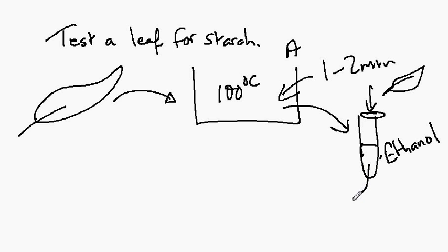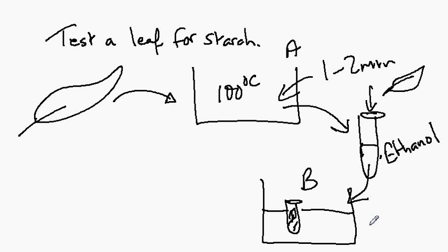Transfer the ethanol leaf test tube to water bath B. Now this is going to be a slightly lower temperature, but it's going to make the ethanol boil. So our test tube is going to be in the water bath and the ethanol is going to be in here with the leaf, and that should stay in there for, let's say, three to four minutes.